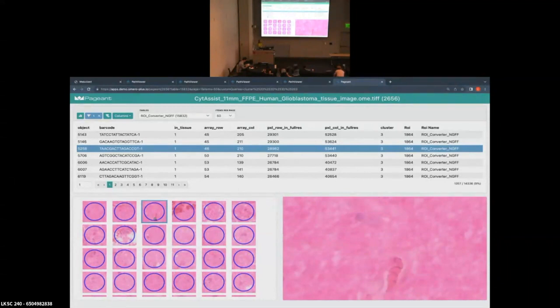Yeah, absolutely. So a couple of options there. Fundamentally, if I use the API in a Jupyter notebook to analyze my imaging data, it's not by default that there's an audit log of every single action that the user took. Now, there is actually an event log in OMERO that tracks some changes. So there's a little bit of that. But fundamentally, it enables you to say, oh, I ran this Python script. I'm going to bring it into OMERO so that my colleague can run the same Python script, but it doesn't require that you do that. So there is still a little bit of user responsibility.